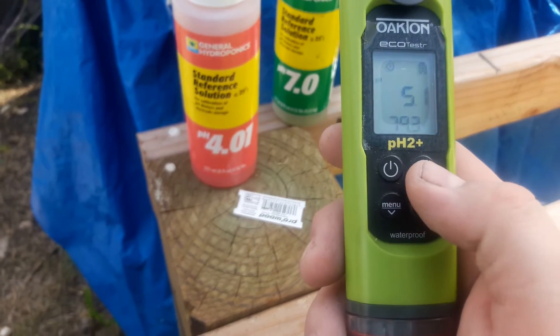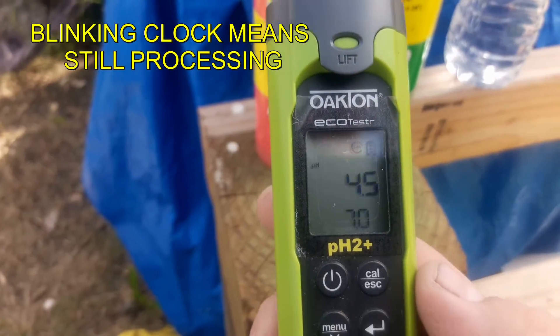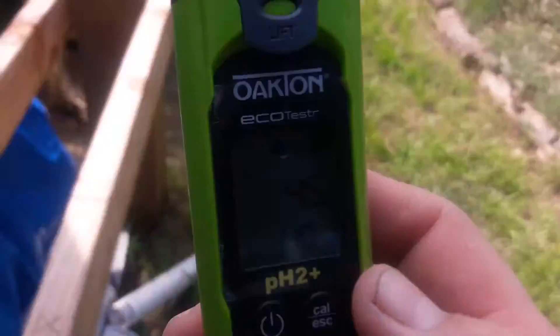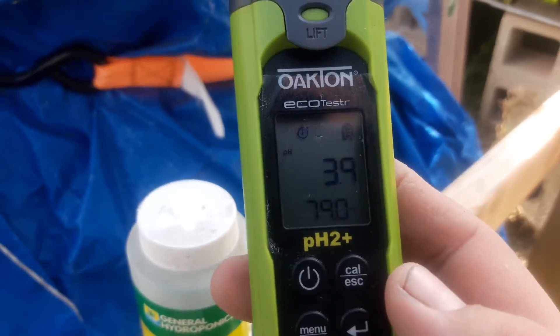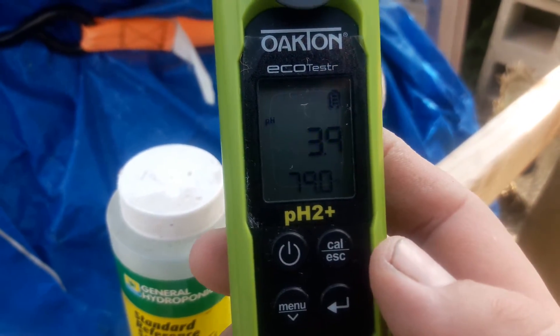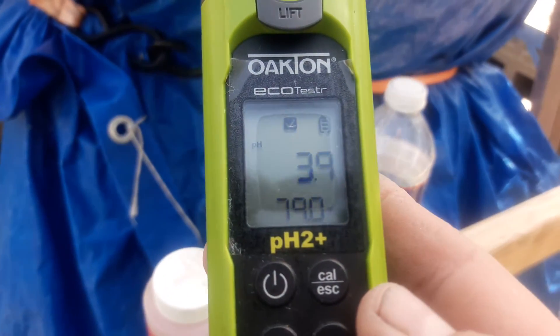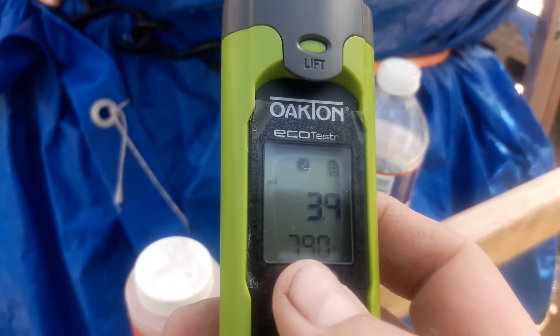Now hit the calibrate button — the CAL button. It says 'done,' and now reads 4.0 to 3.9, so that's the first calibration point complete. You can also see the temperature reading showing 79 degrees for the liquid right there.